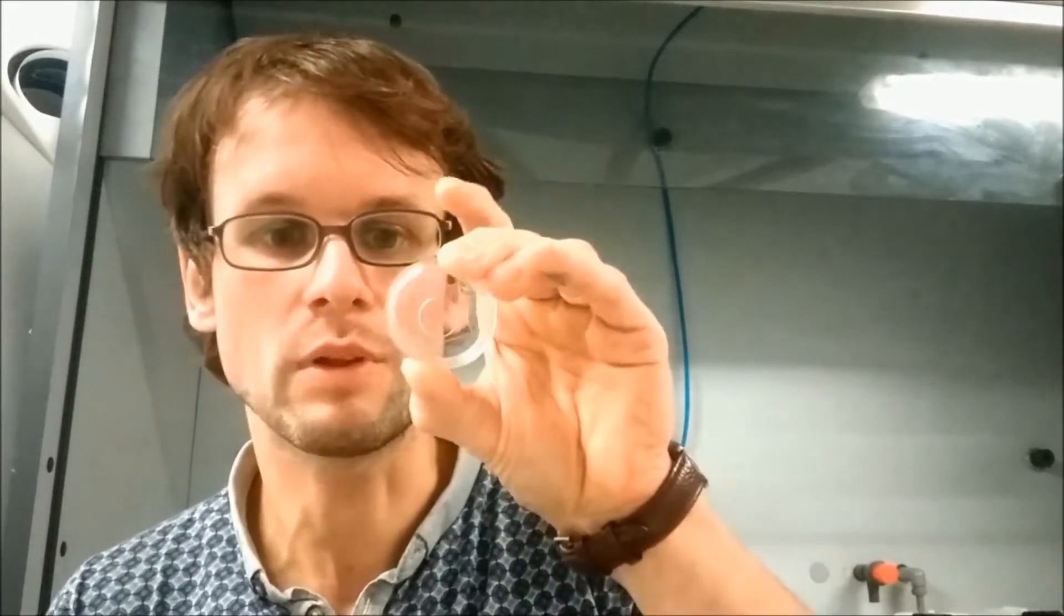Using a normal microscope, you can analyze only one sample at once, whereas using a special microscope called operetta, you can analyze almost 400 samples at once, which is perfect and saves you time.